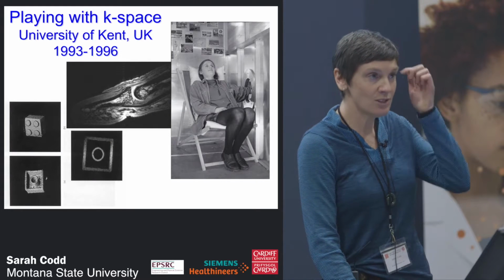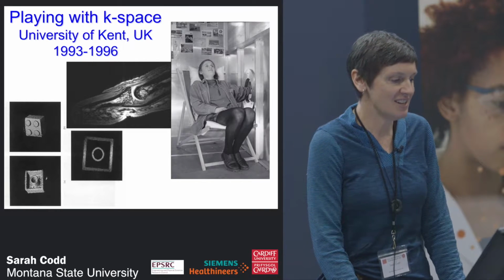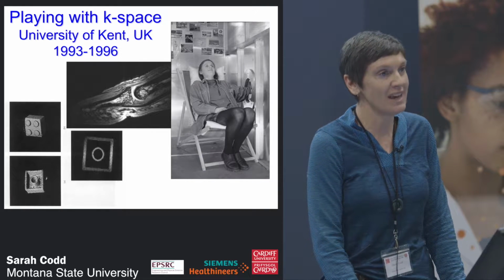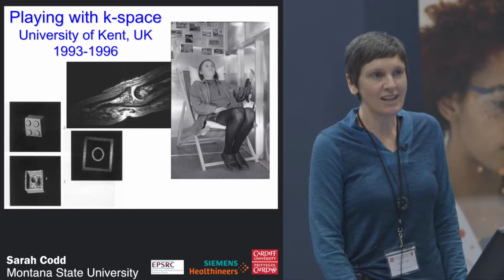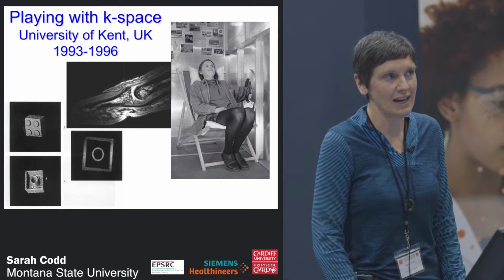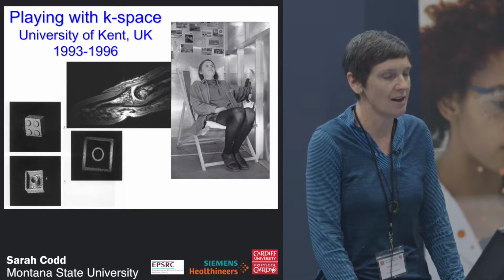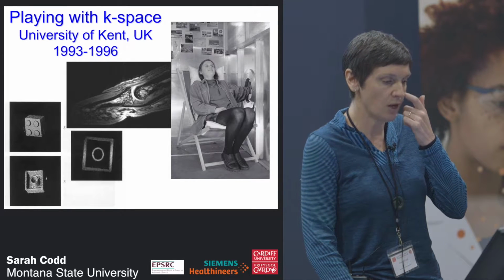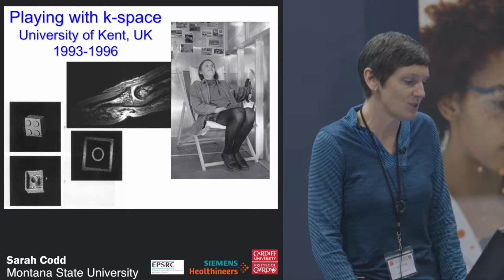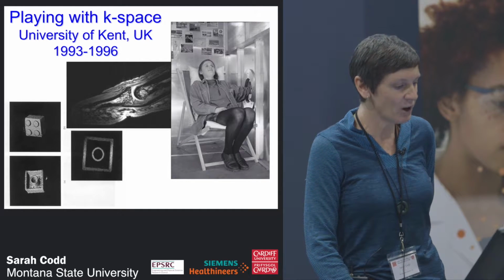And so I ended up going to University of Kent at Canterbury and doing my PhD, and I was working in the world of K-space at that time, looking at the way we could use oscillating gradients to maybe access more solid-like materials to do imaging, because at the time imaging was really only working well in the body, on the liquid components, and so we used oscillating gradients, and our model for cartilage at the time was a piece of Lego.